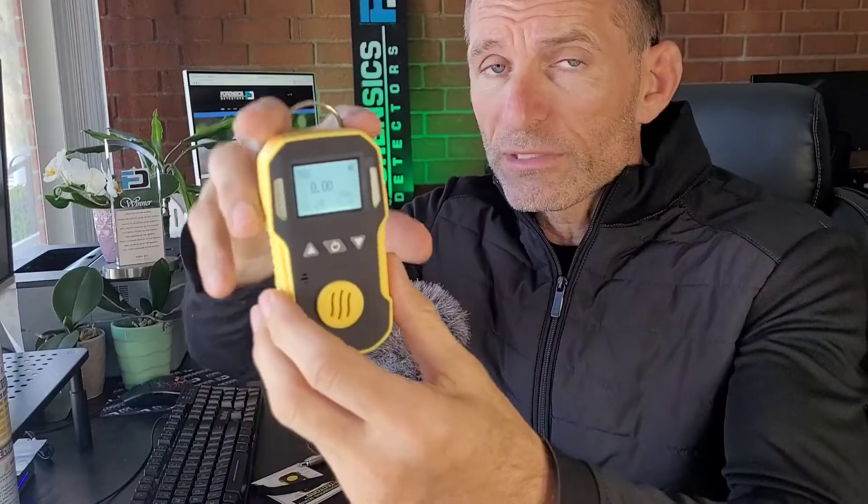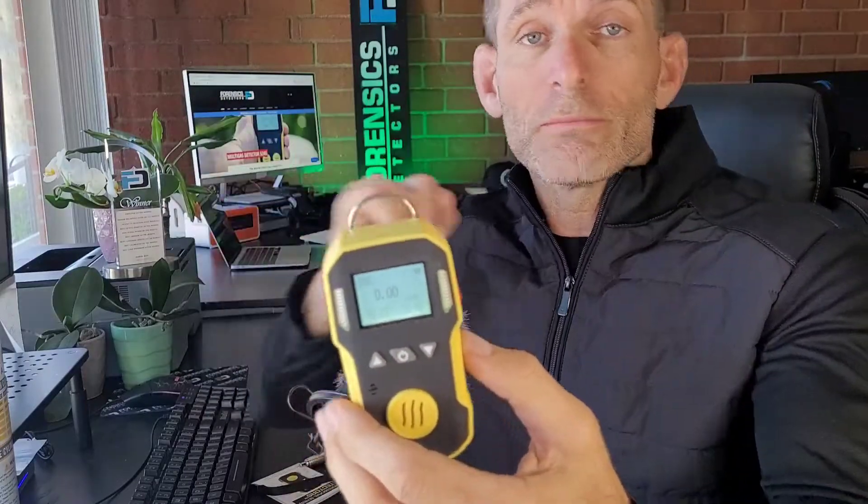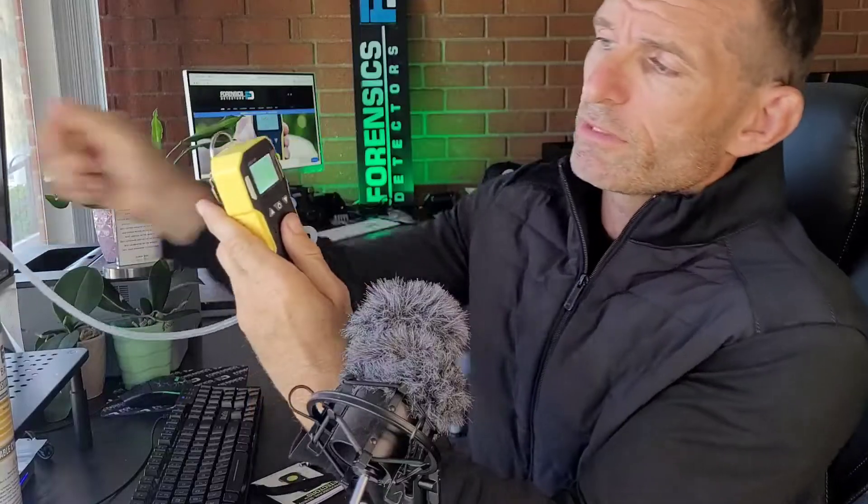This detector will cover you — it handles 0 to 10 ppm in range and 0.01 ppm in resolution, which is very sensitive. I'm going to give it a quick spray and you'll see it climbing up, then climbing back down. The sensor is at the front, detecting mercaptan molecules. It has an amazing sensor made in Germany, which is why it can detect those very fine molecules.